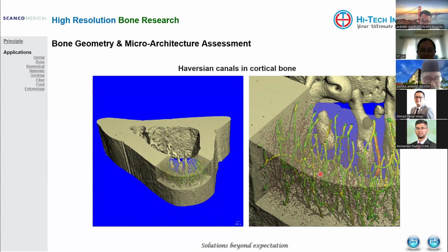So the densities, and the color coding of new bone. I think we can look into those parameters and try. If there is a density difference, especially from the young cells to the mature cells, we should be able to identify them. All right. I have many questions, so I will be brief.